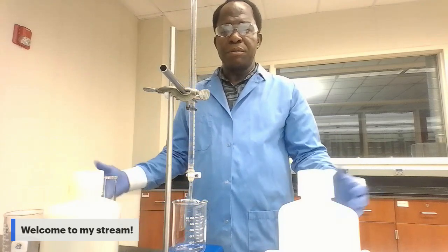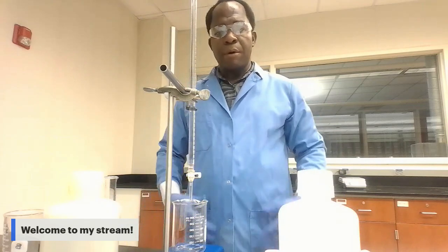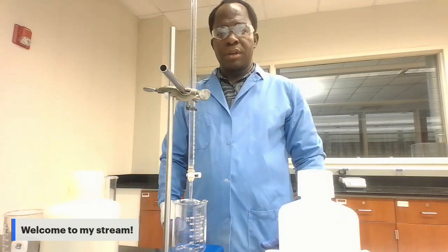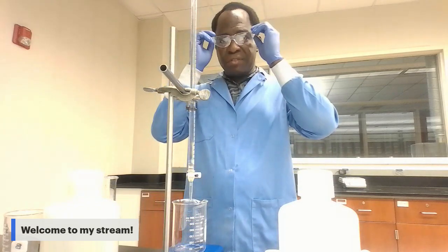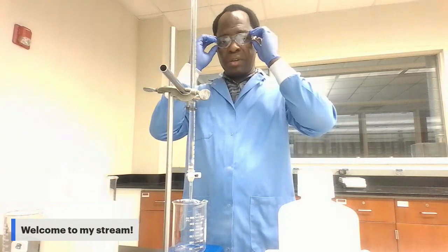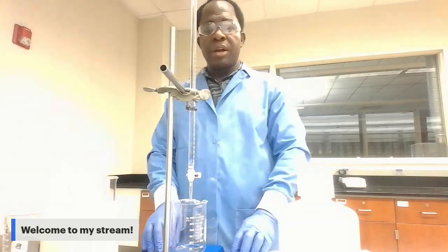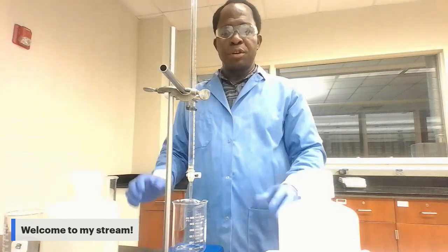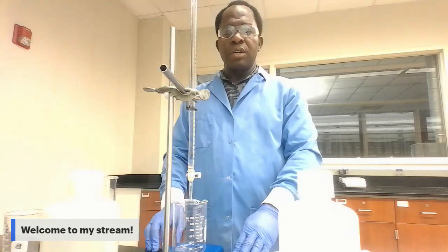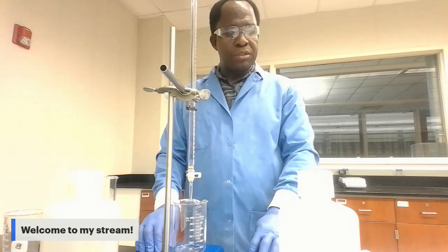Before you start this lab, you have to make sure you have your lab coats on, your safety goggles on, and shoes completely covering your toes. Make sure you have those on during the whole lab procedure.